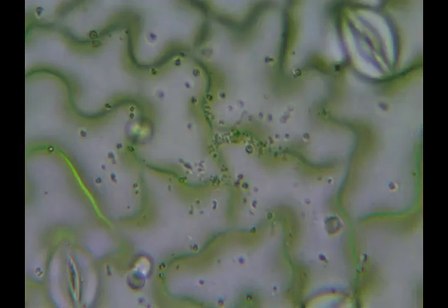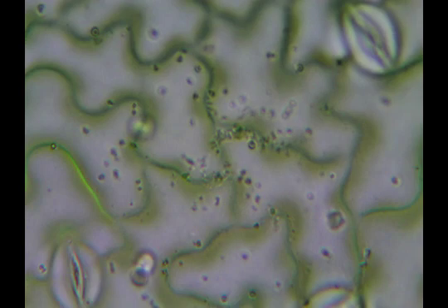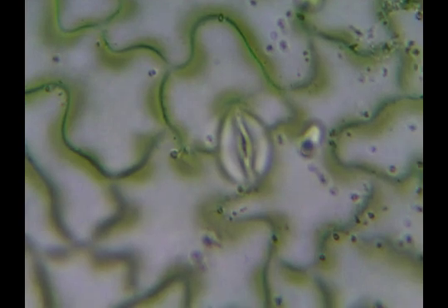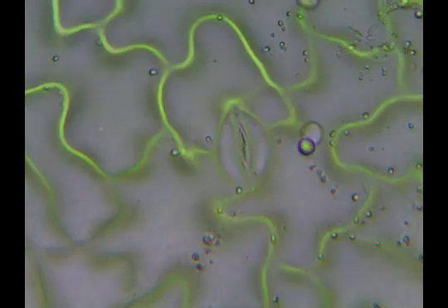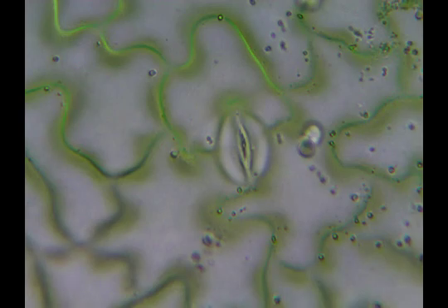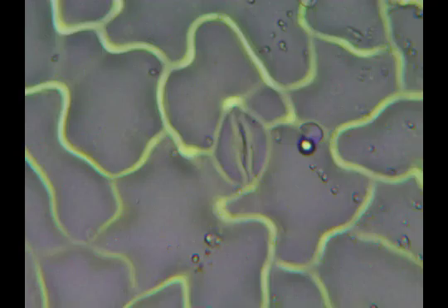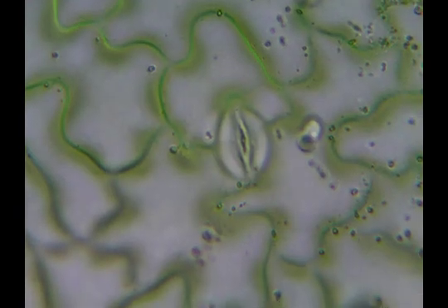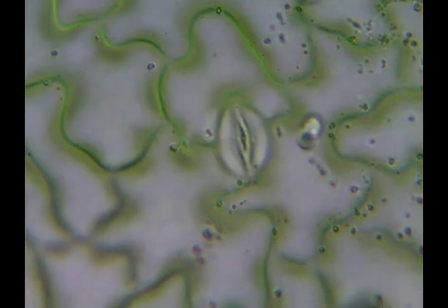We're going to see if we can get one of the stoma in nice and clear. We've got two here; I'll try to get one right in the middle. It looks like a pair of lips there. Those are the guard cells on the outside, and then the opening is a little bit darker in the center. I'm going to bring it in a little bit clearer, and then we'll label it.